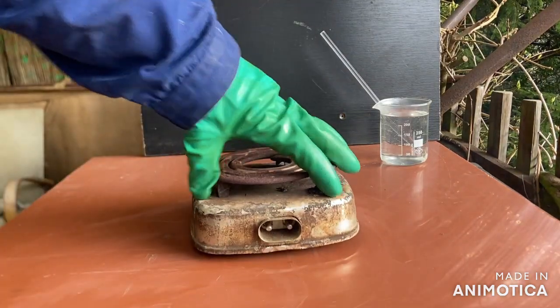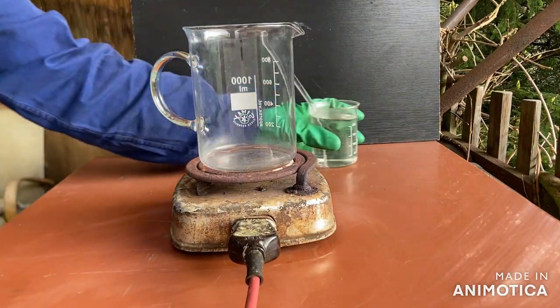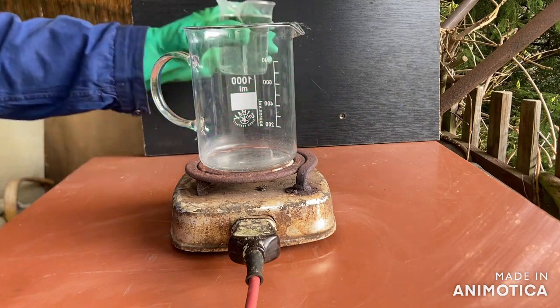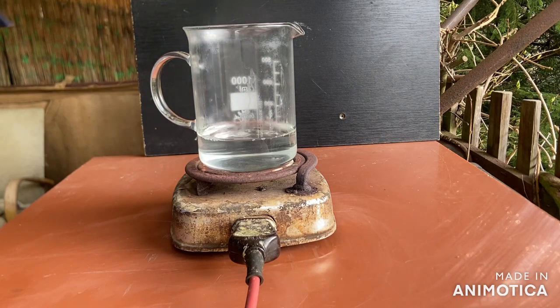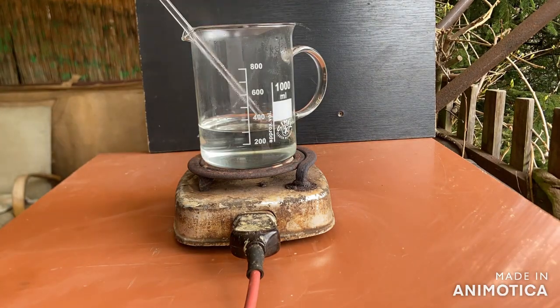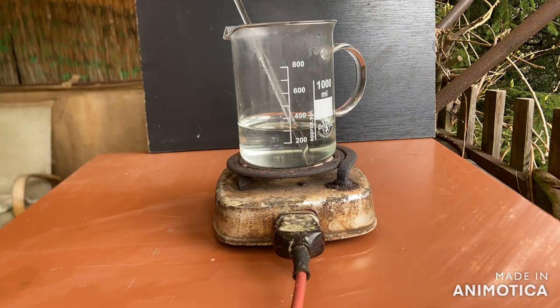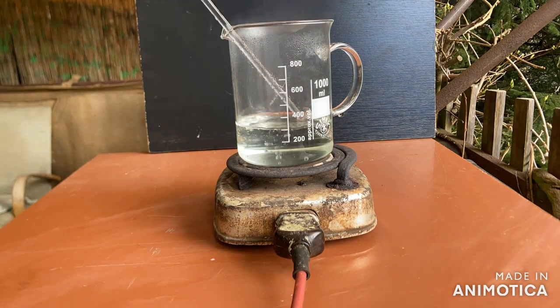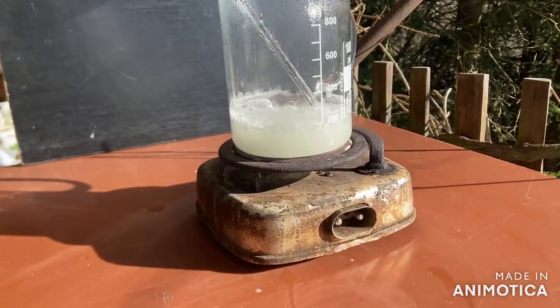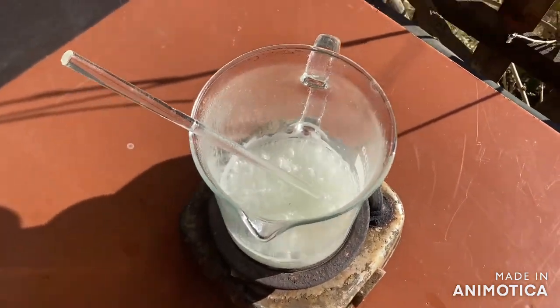Now we need to boil down the solution. At this point, despite the solution literally boiling, a lot of ammonium chloride has precipitated.